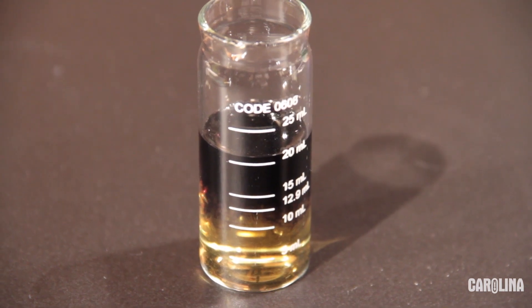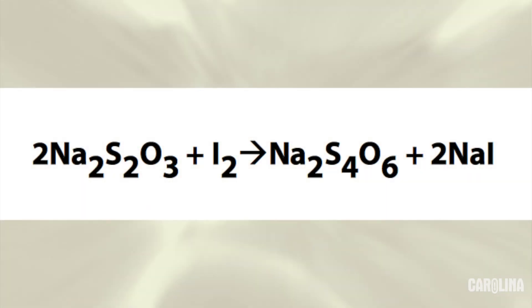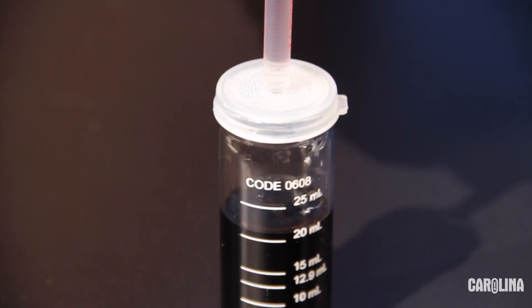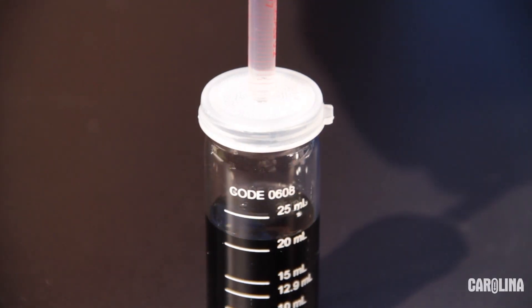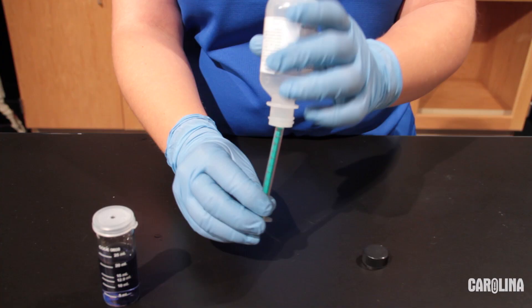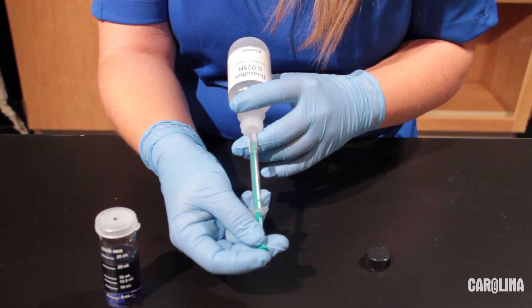In the presence of the starch indicator solution, free iodine causes the solution to turn blue, as you see. As we continue the titration, sodium thiosulfate in the syringe reacts with the free iodine to convert it to sodium iodide. Sodium iodide does not react with the starch indicator solution, so the solution will turn clear once all the free iodine is converted. Replace the lid and continue the titration as before, gently swirling between each drop. If the blue color remains after the addition of an entire syringe, refill the syringe and continue.